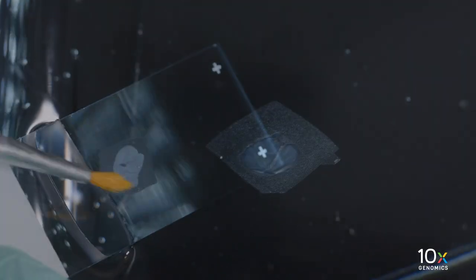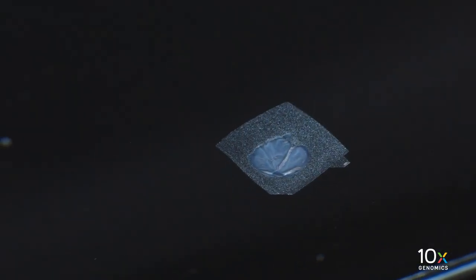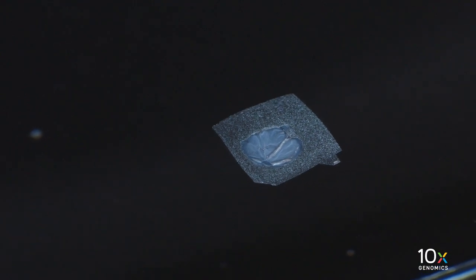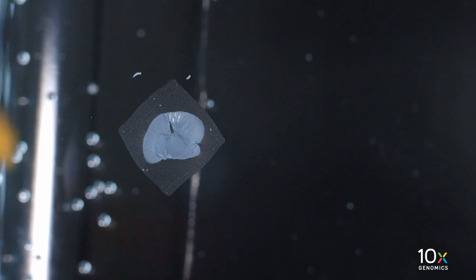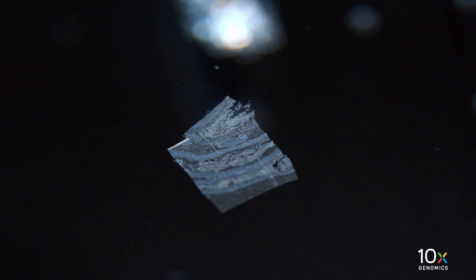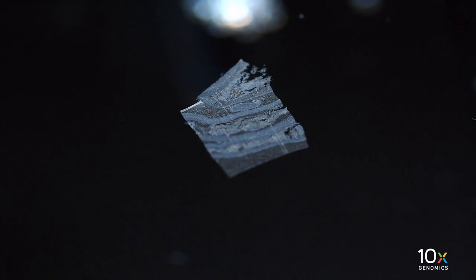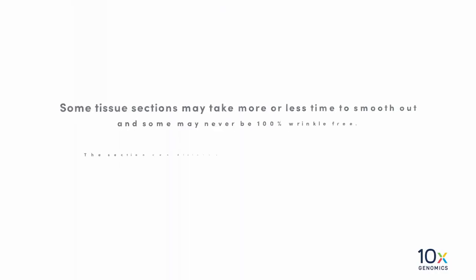If the section is too creased or puckered, let it float longer. Float the section on a plain glass slide for a quality check and confirm under a microscope. In this example, the section has wrinkles, which suggests insufficient floating time — the floating time should be increased. In this example, the section is flat with no wrinkles, which suggests sufficient floating time and the section is ready to be placed on the Visium slide. In this example, the section is torn, which suggests the section was left too long in the water bath — the floating time should be decreased.